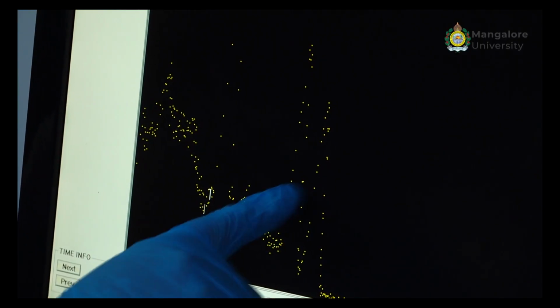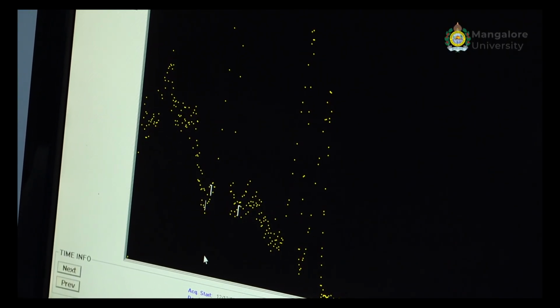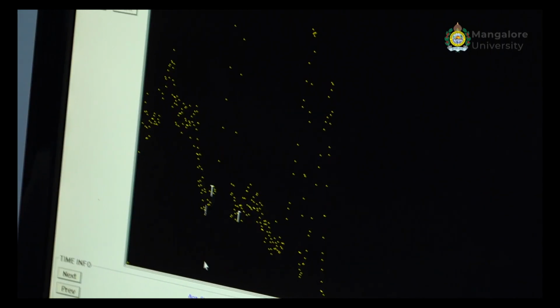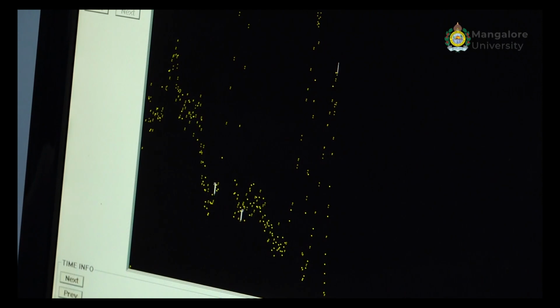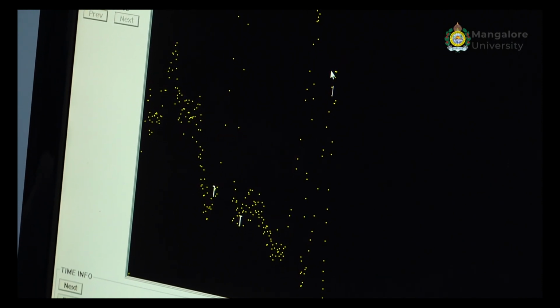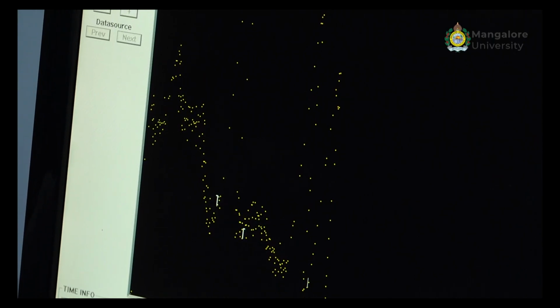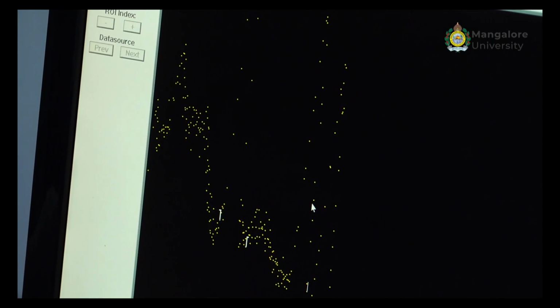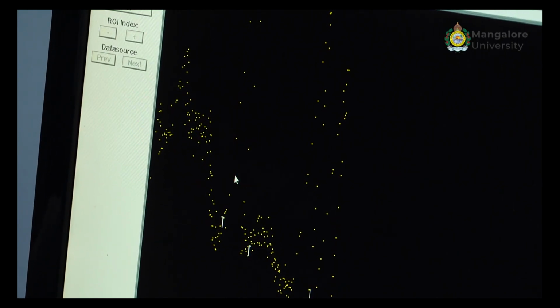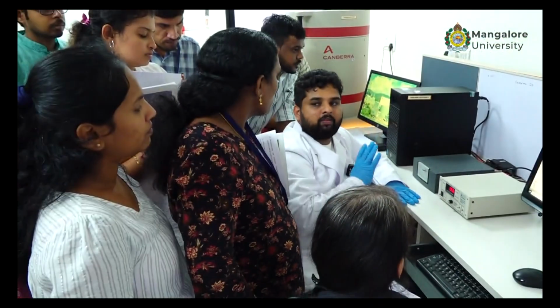See these two peaks, you remember how it was shown in HPG, don't you? It was very spacious, very well distinguished. Now look at this. It is 1180 and 1332. It's all nearby, very close, like only one channel is separating both of them. So counts from this can spill over to this, counts from this can spill over to that. So that resolution is less. So that is why we prefer HPG.